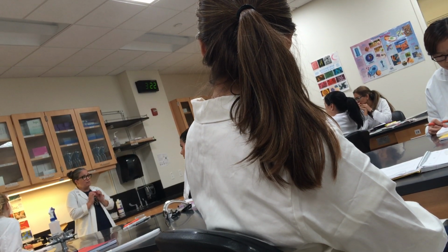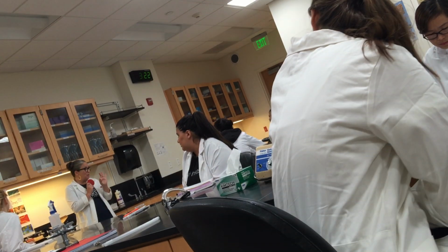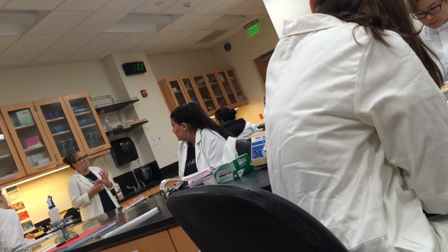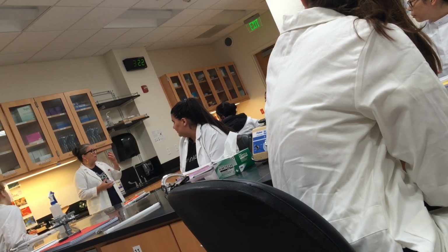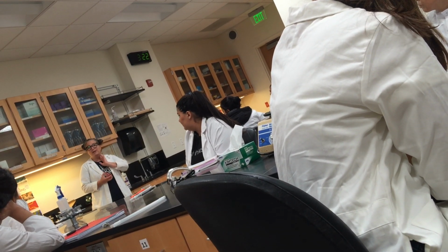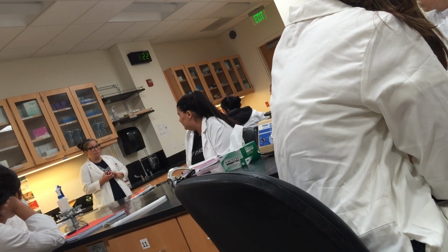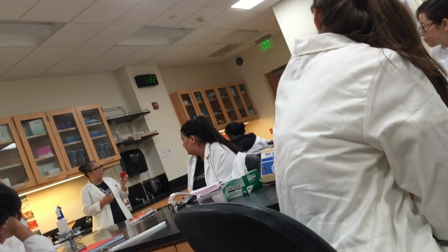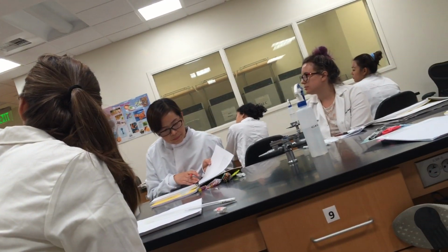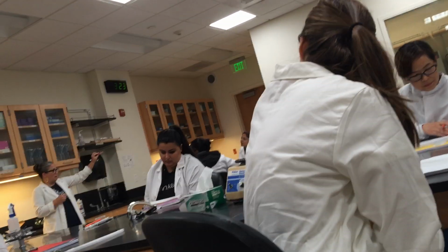So if you have been chosen, and I think it's 3 of you, you will cough vigorously. So don't be a baby about it, right? You're going to open it and try to cough what is in your pharynx out onto the plate. So give it some vigorous coughs. And then all of those plates are going to go agar side up, which feels upside down, but it's not. Agar side up into the incubator.